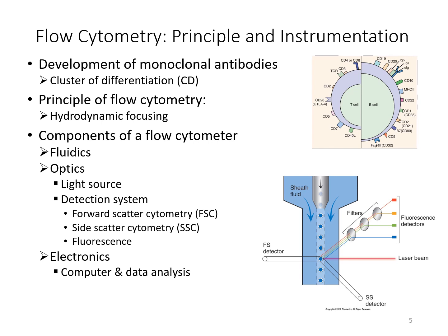So flow cytometry uses hydrodynamic focusing, which allows the cell to enter into the center of this sheath flow, either inside of a particular carrying fluid. Once it enters into that sheath flow, the single cell itself will scatter light as it enters one or more of the various light path sources, and there's an excitation going on.